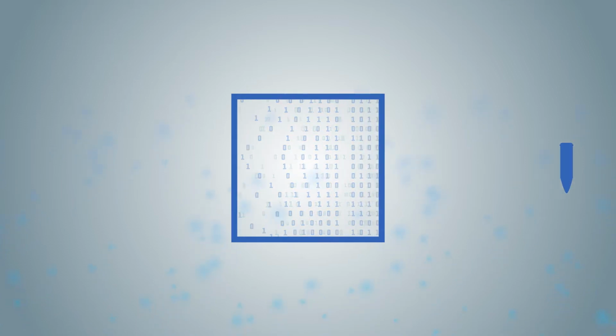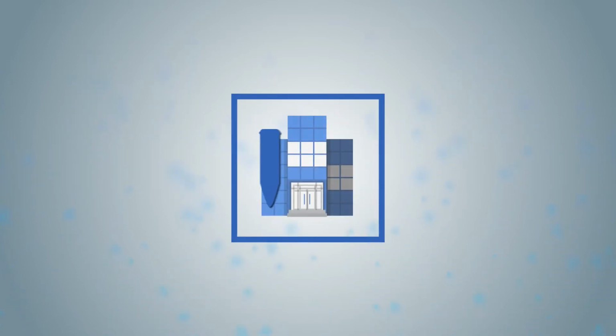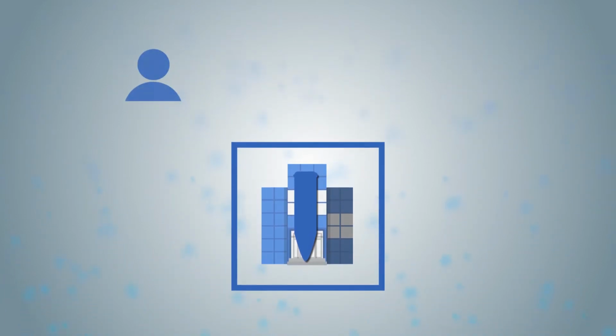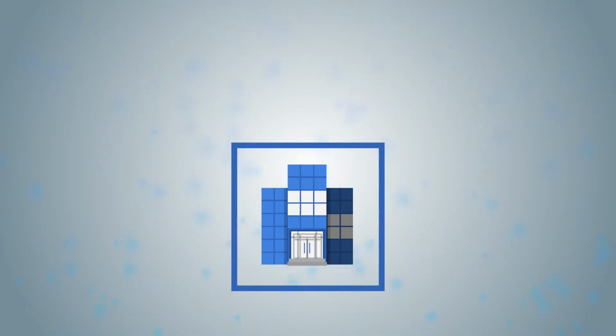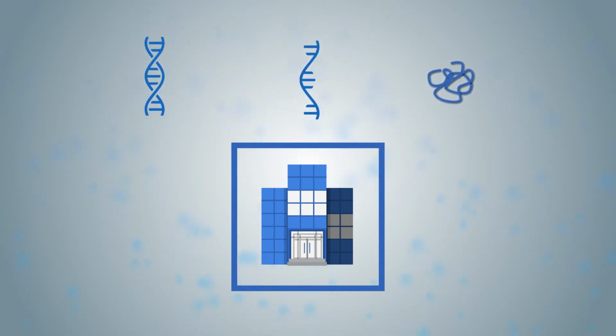Your sample arrives at one of QBiC's partner labs, for example at one of our sequencing or mass spectrometry partners. The sample could be human tissue, a blood or fecal sample, a plant or an environmental sample. Literally any biomaterial. In the wet lab, the experts isolate material from the sample, such as DNA, RNA, or protein.